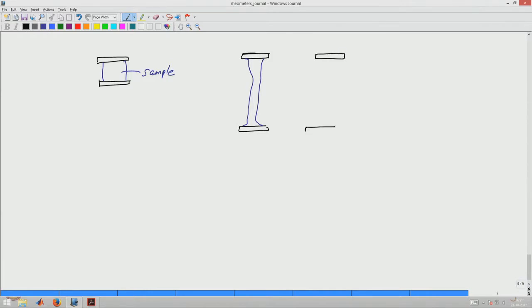What would you expect might happen to a viscoelastic fluid that is suddenly stretched and left there?